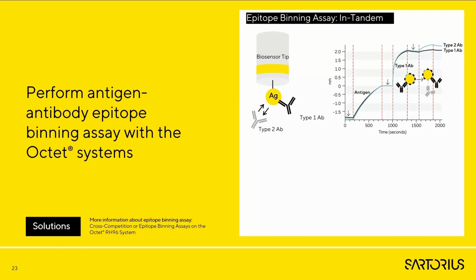This indicates that once antigens are bound to the type 1 antibody, the epitope for type 2 antibody might be inaccessible due to steric hindrance. As a result, the binding occurred with a slow shift in the binding rate. This nicely explains the lateral flow test performance.